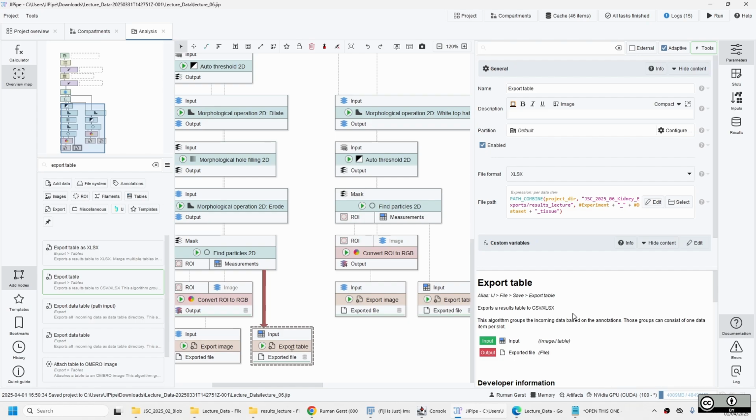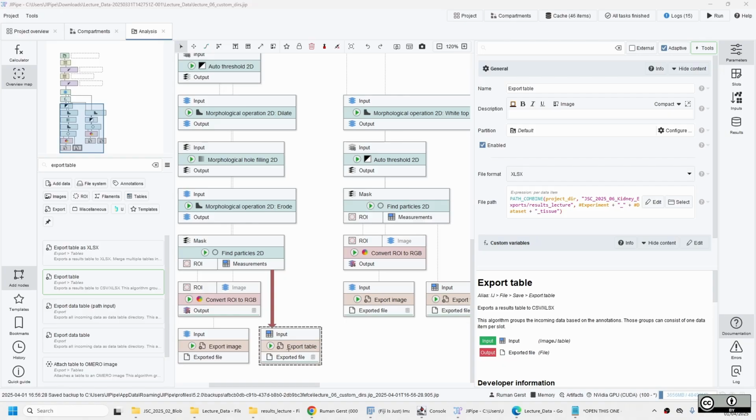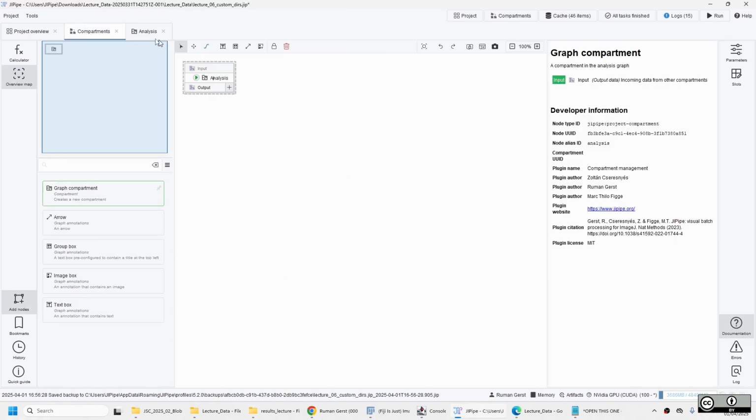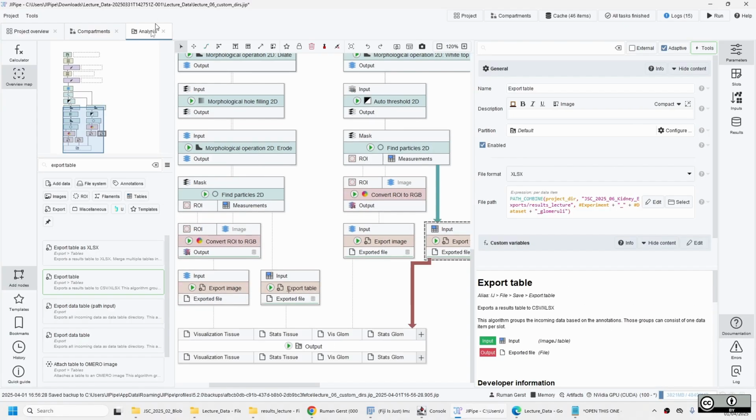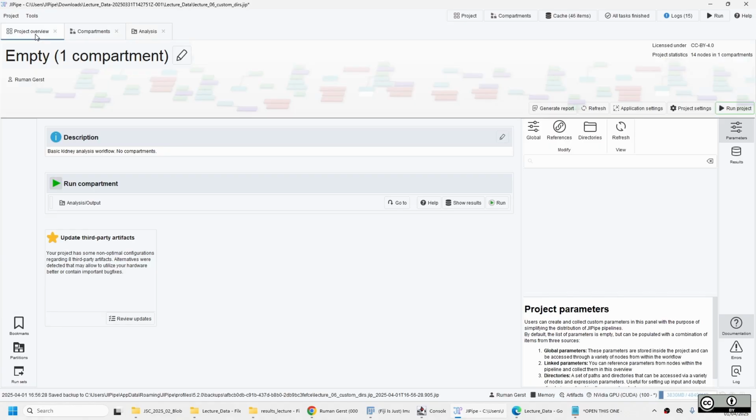You can have a global results directory and then use this one to save it out there. So that's why it's useful to have the outputs. When I make an output here, as shown before, I can absolutely connect my files here. Then you can just run it all at once, so you don't have to run like 4 nodes. And you can run them from here, and you can run them from here too. So this is useful.